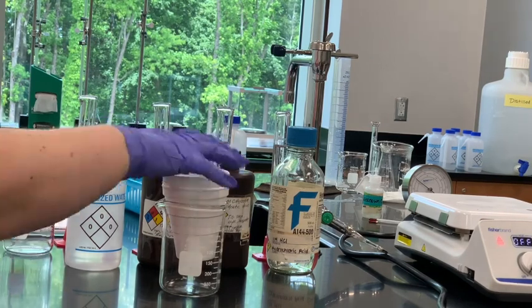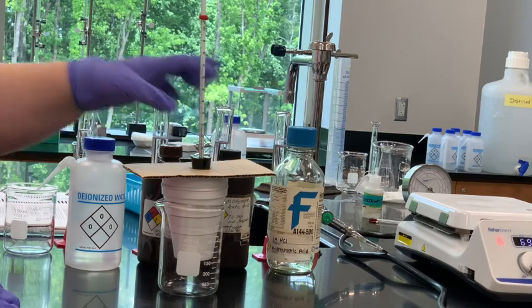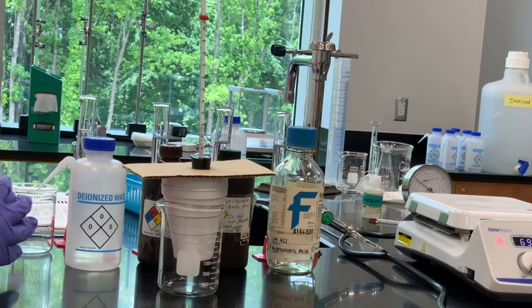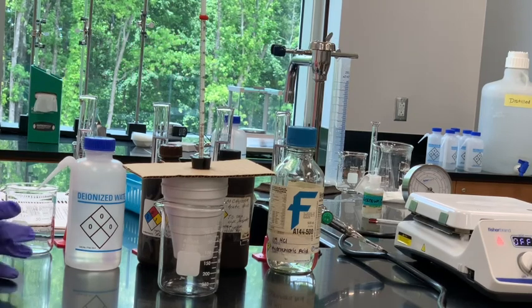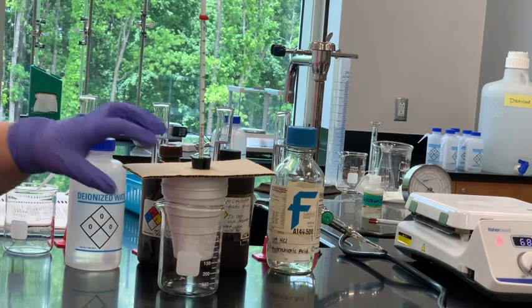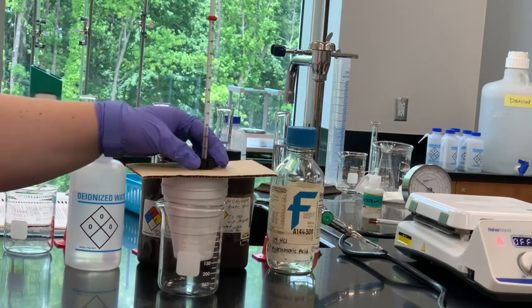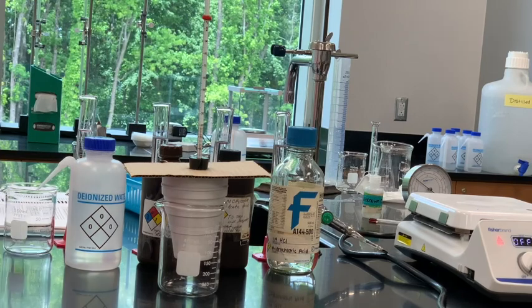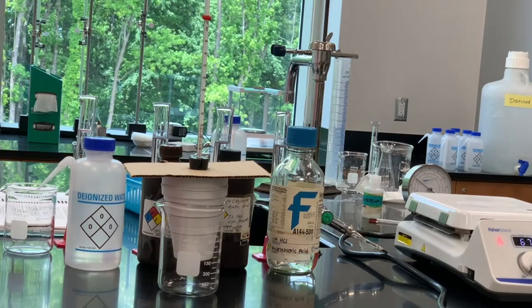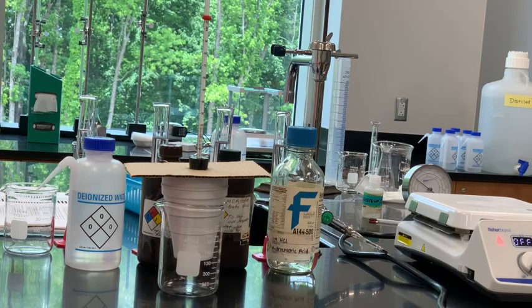We're also going to put on top of the calorimeter a piece of cardboard that has a hole in it so we can fit our stopper and thermometer in. Think about whether this setup is likely to keep in all the heat that's released inside. It's definitely not going to be perfect — the cardboard just sits on top of the cups, there's a large hole that isn't sealed, and we're using styrofoam with a lid that doesn't really fit. Keep that in mind when answering questions today.